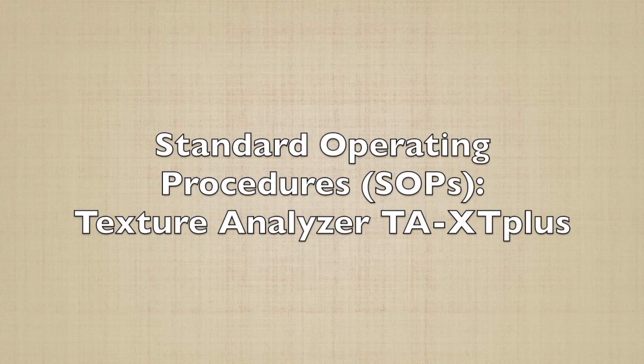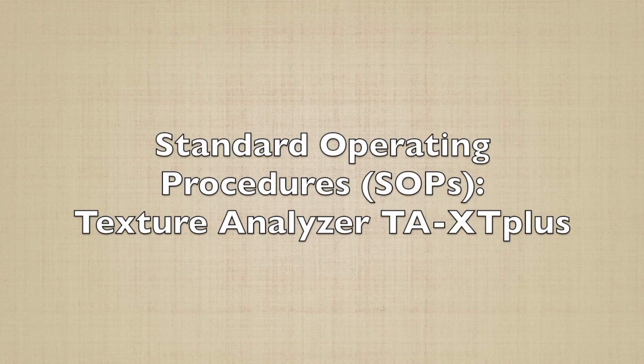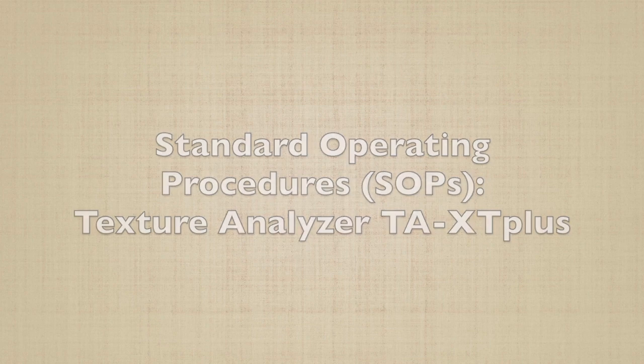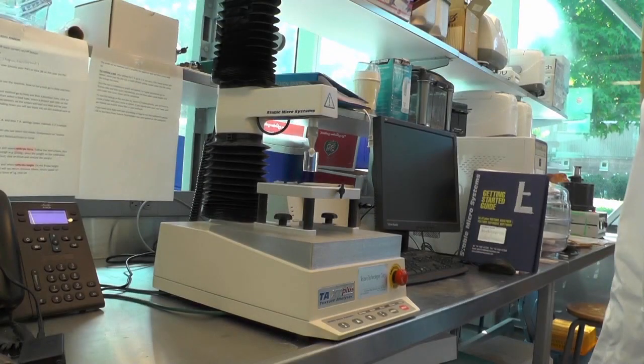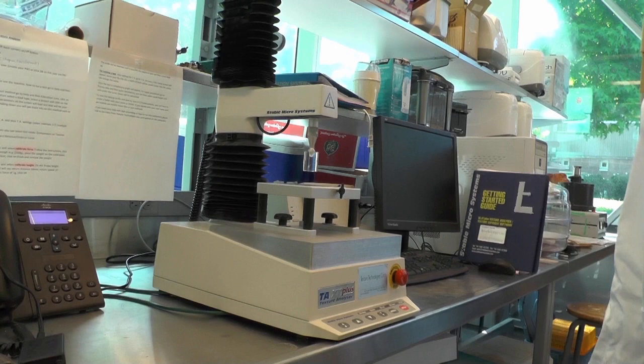In this video, you will learn how to use the Texture Analyzer TAXT Plus according to the standard operating procedures. This is the Texture Analyzer TAXT Plus.